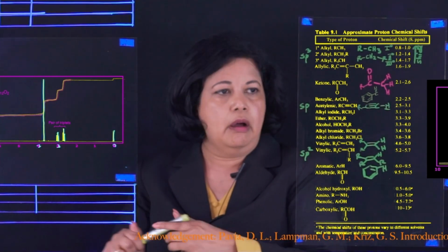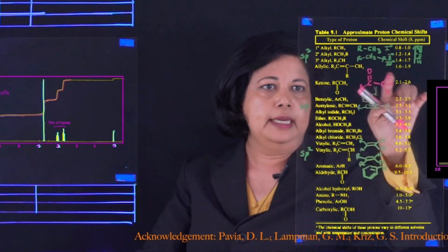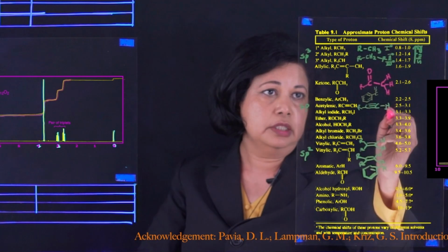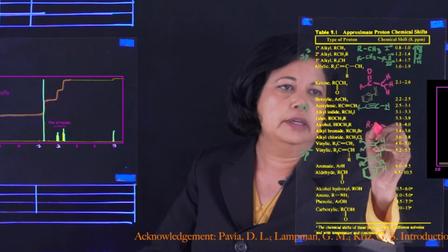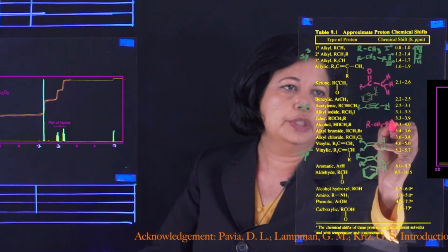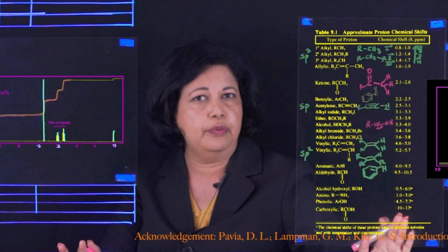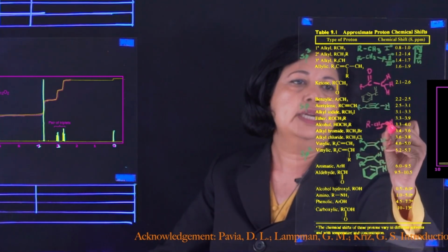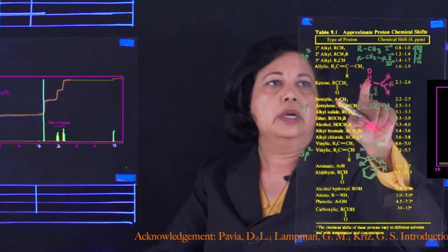So going back to oxygens here, you can have next to a carbonyl, you can have it right next to an oxygen itself. So if you have an alcohol, or CH2OH, these hydrogens can be somewhere between 3.3 to 4. Okay, so that's very de-shielded because this is directly connected to an oxygen, which is different from being connected to a carbonyl here.